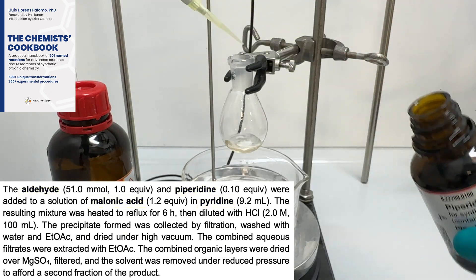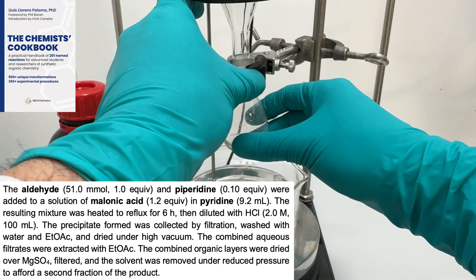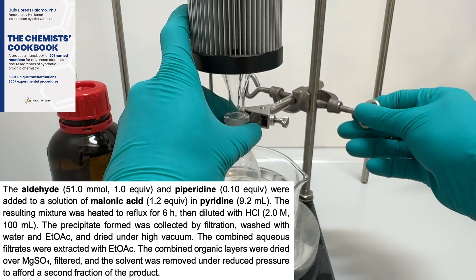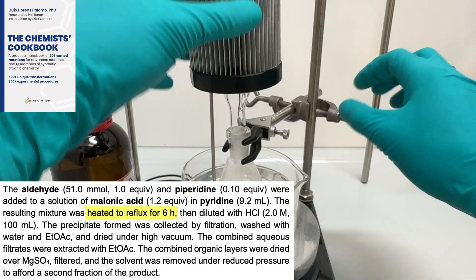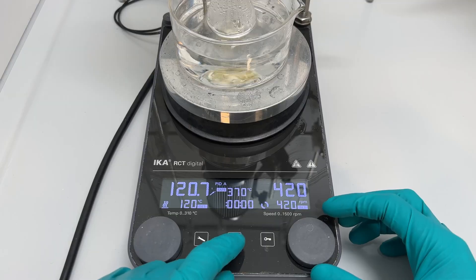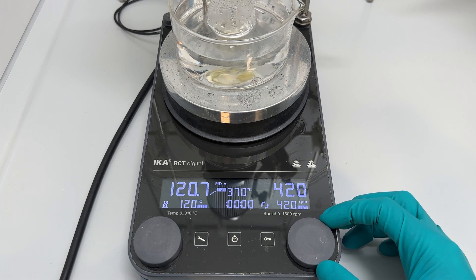After the addition of all the reagents was complete, I attached a condenser and lowered the round-bottom flask into a preheated oil bath. According to the procedure, the reaction should be complete within 6 hours of stirring at reflux temperature. However, it was already late and my shift was ending soon, so I decided to use a timer to stop the heating after 6 hours.